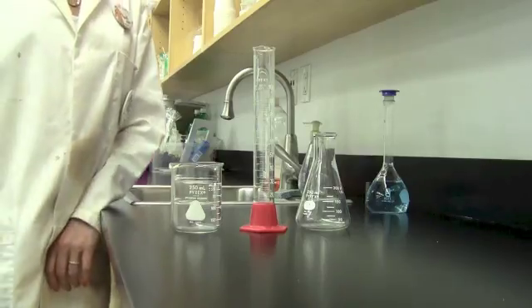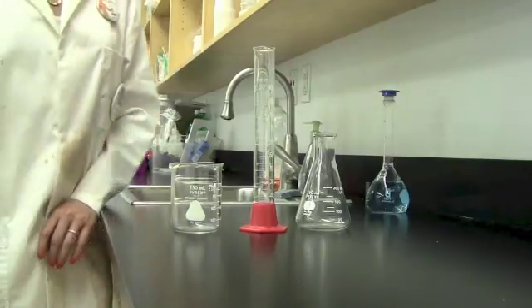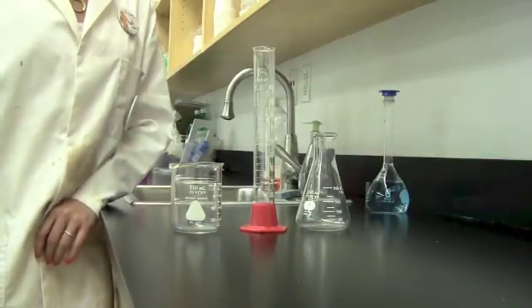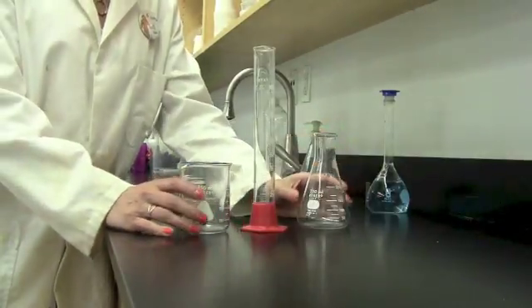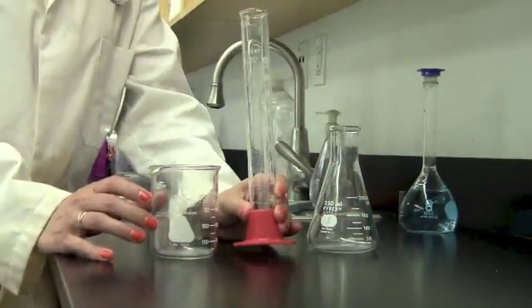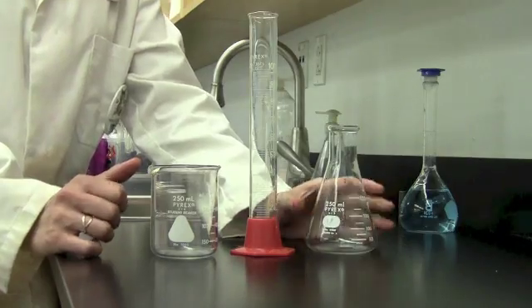Now we're going to look at how to measure volume of a liquid. When you look in the cabinet of glassware above your lab station, you'll find these three pieces of glassware. We have a beaker, a graduated cylinder, and a flask.